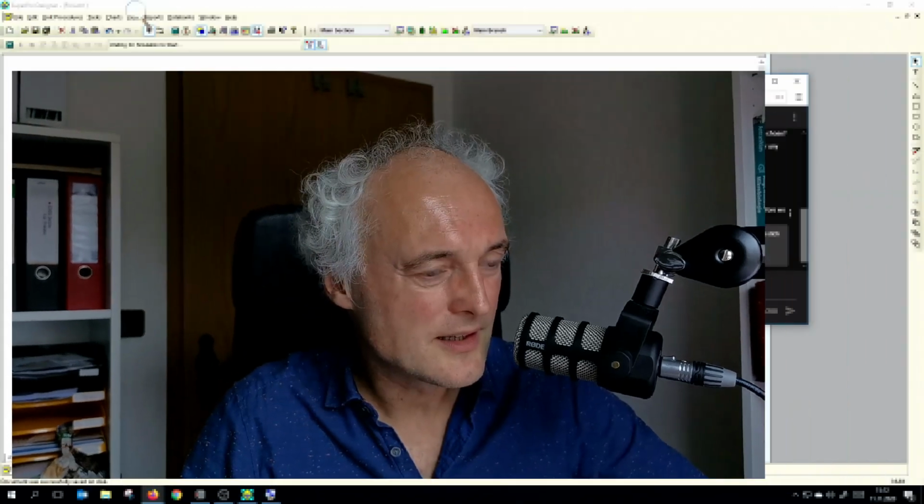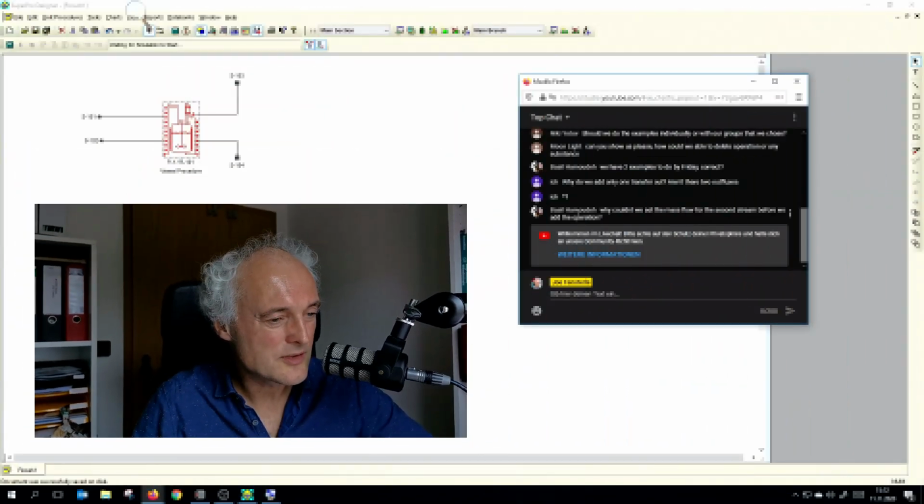So put your unit, draw your streams, initialize the streams with the composition, and then go to your operation. It's just that you get some routine, because each time you make an error, you might have an error at the end of your mass balance and you don't know what actually happened. This is the problem. Okay, so just again having a look at why do we add only one transfer out?